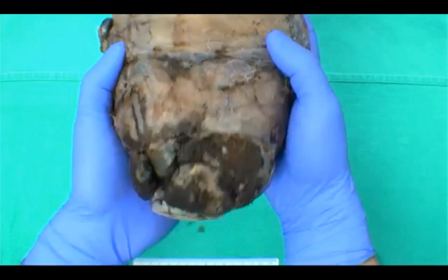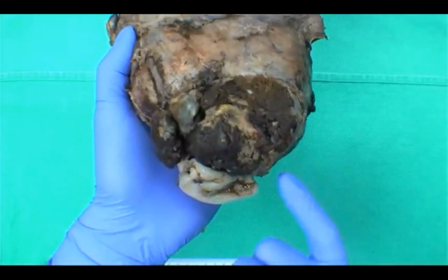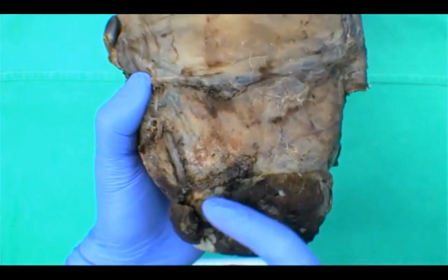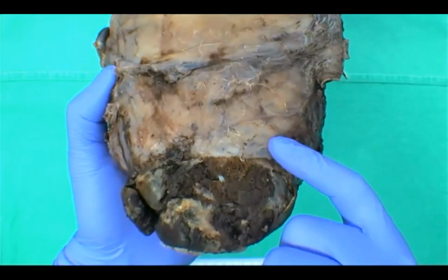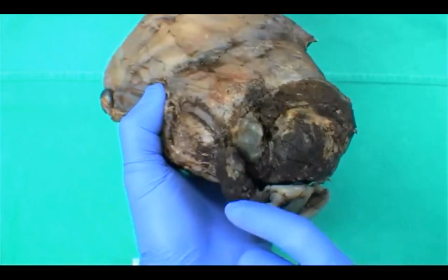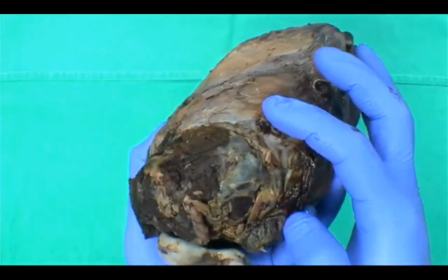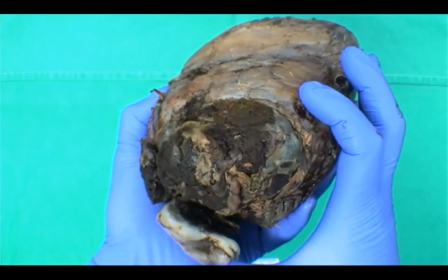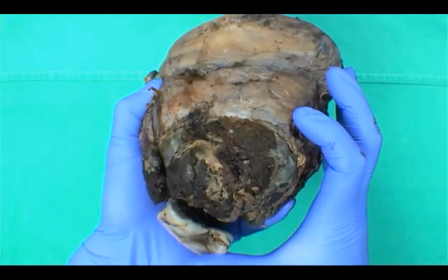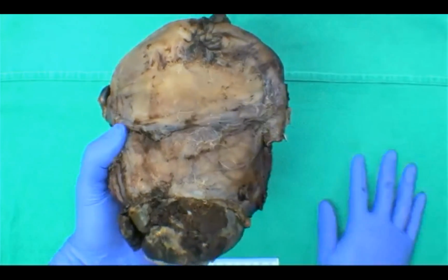Okay. Right. If we go back to the specimen itself, looking at the lower uterine segment of the anterior aspect, you can see this big disrupted area. This is actually placental parenchyma poking out. You can see the difference. This is soft tissue from the uterus, and then you get this big disrupted area with the placental parenchyma poking out. So we're at least at a grade 3D. It's possible that we have 3E as well, but since we don't have any adherent structures present in the specimen, we can't make that call. Okay. Very good.